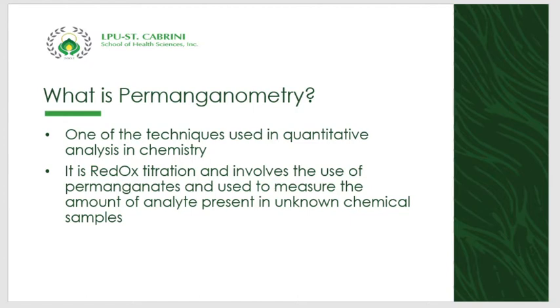Okay, so in permanganometry, it involves two steps. First, the titration of the analyte with potassium permanganate solution, and then, of course, the standardization of potassium permanganate solution with standard sodium oxalate solution. So itong permanganometry, of course, deals with your potassium permanganate.